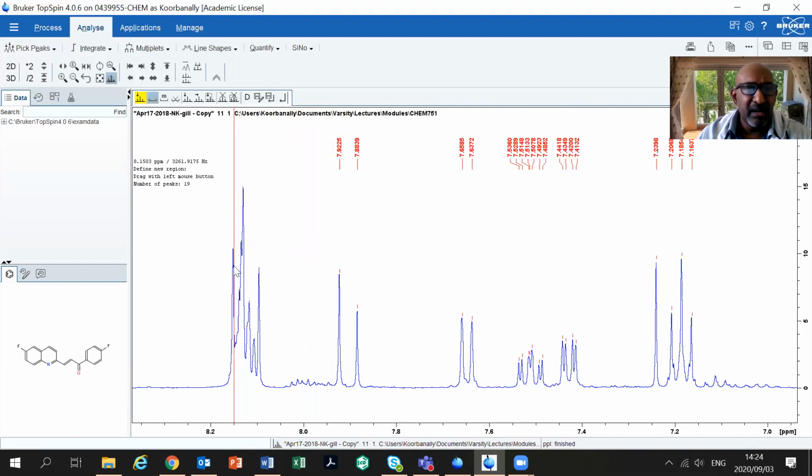All right, now if I'm going to choose this, I might say, okay, I want that peak and that peak and that peak and that peak and that peak, right? So I'm going to choose my square to encompass all those peaks that you see. If I stop here, I'm not going to get this peak, the small one down here.